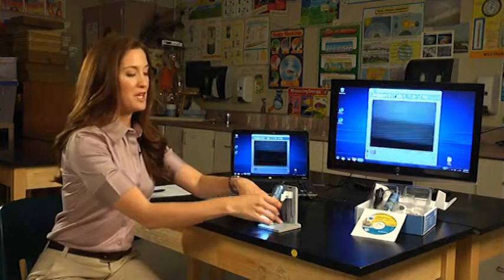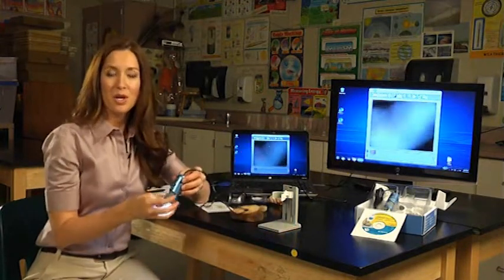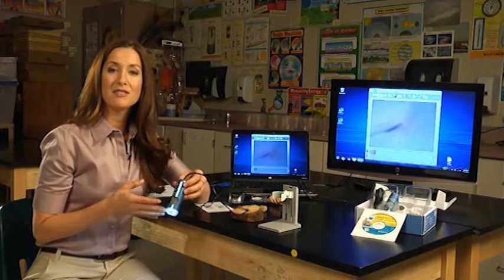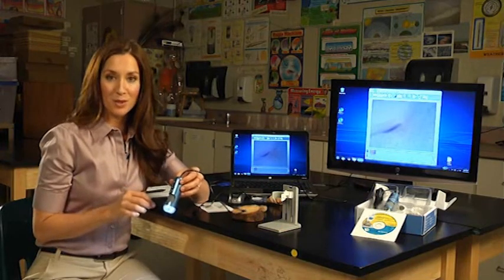Hi, I'm Shannon. Here to give you a quick overview on the SmartScope 5M. The SmartScope 5M is a handheld digital microscope. What really makes this stand out is the fact that you get 5 megapixel resolution.